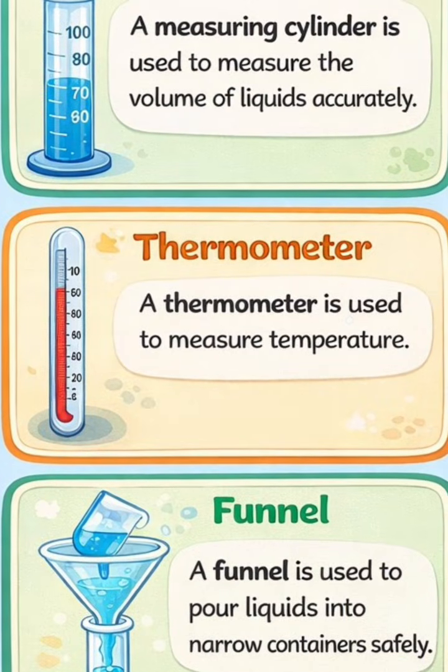Next, thermometer. A thermometer is used to measure temperature. You use it at home, you see it at school, in the lab, maybe also in sick bay. So, the thermometer is used to measure any temperature.